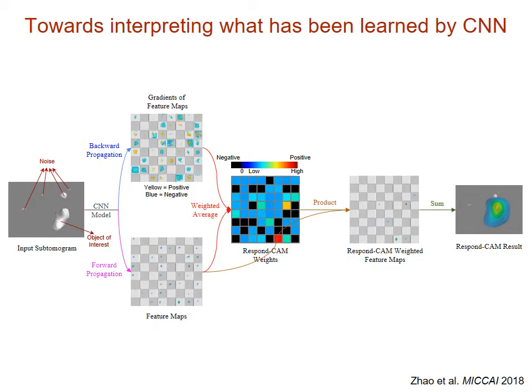In order to inspect the regions of interest that contribute to the classification decision of this neural network model, we have also developed a visualization technique. And this work has been published at the MICCAI conference, which is the top conference in biomedical image analysis.